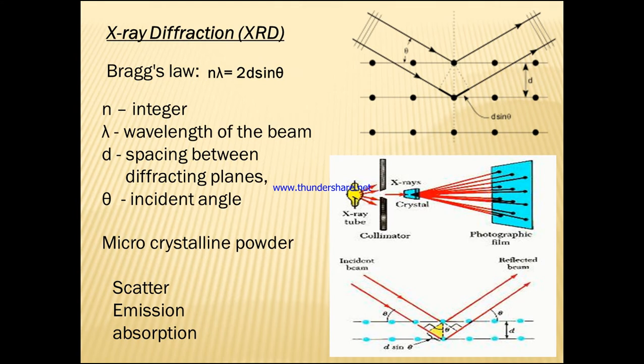For example, when an electron is pushed out of the L shell, the gap has to be filled, so an electron from the M shell will come and sit in the gap. So the gap is filled by an electron with higher energy. When this is done in this way, we can see the X-ray emission there.